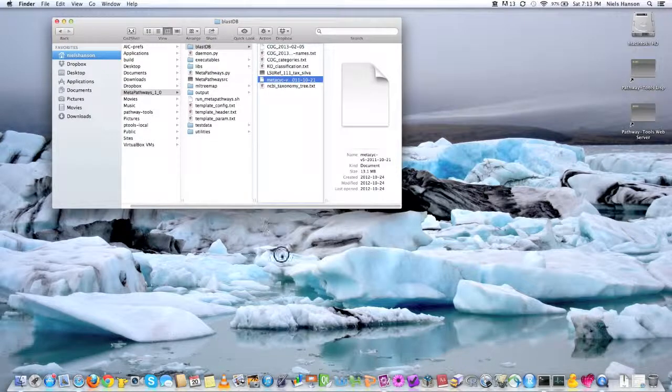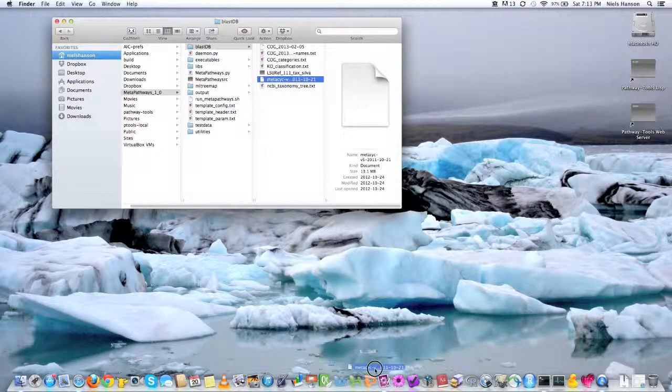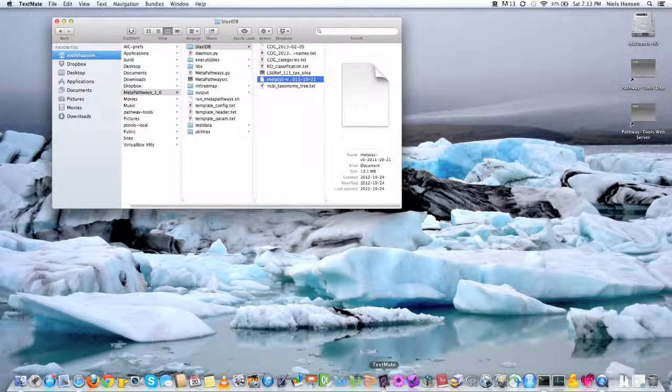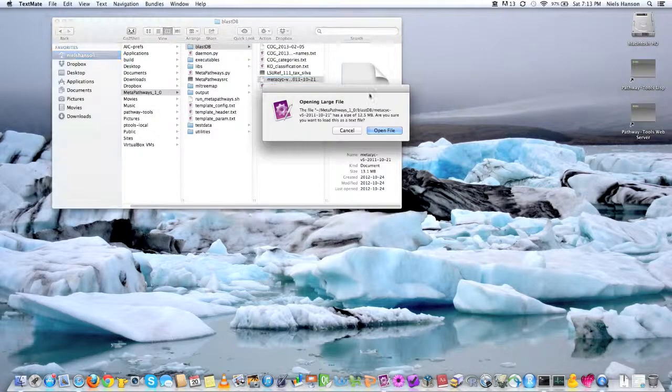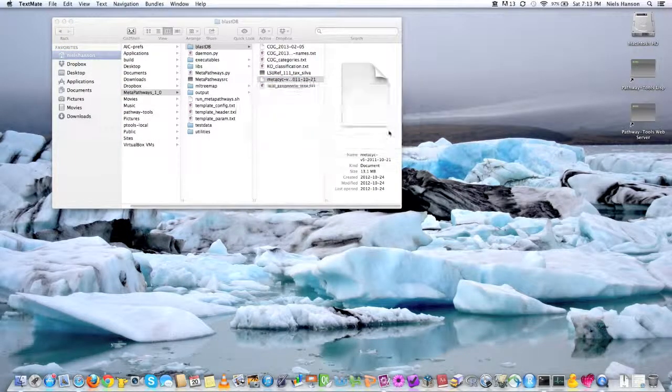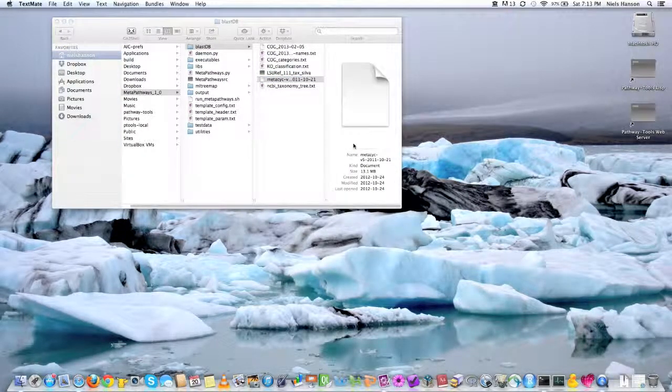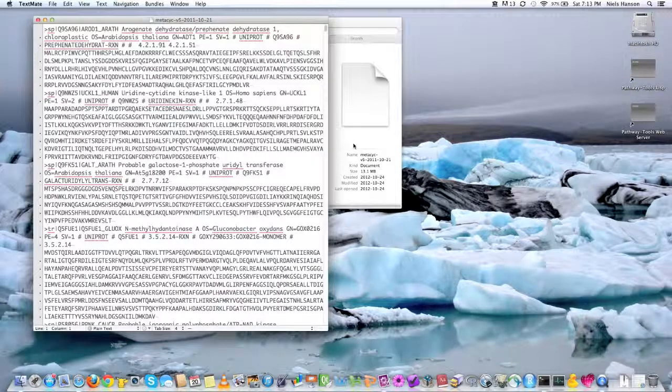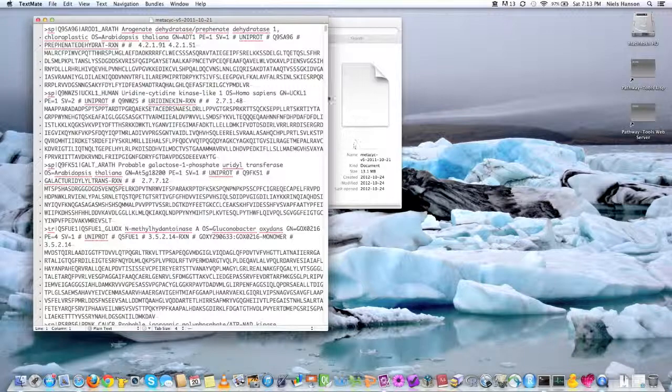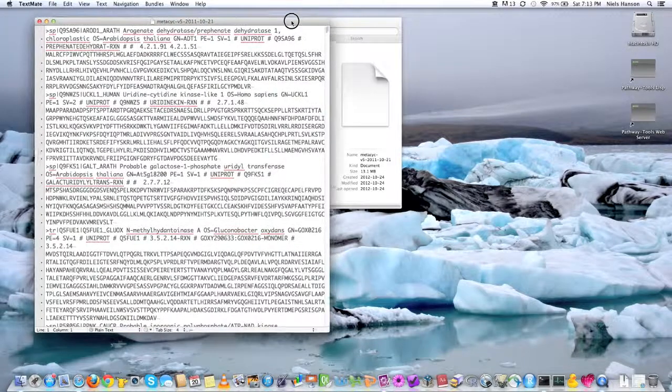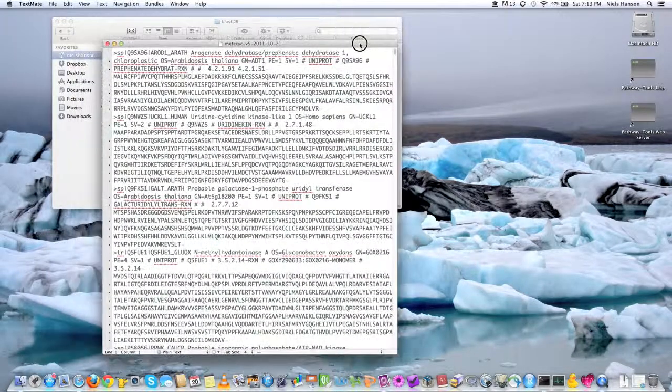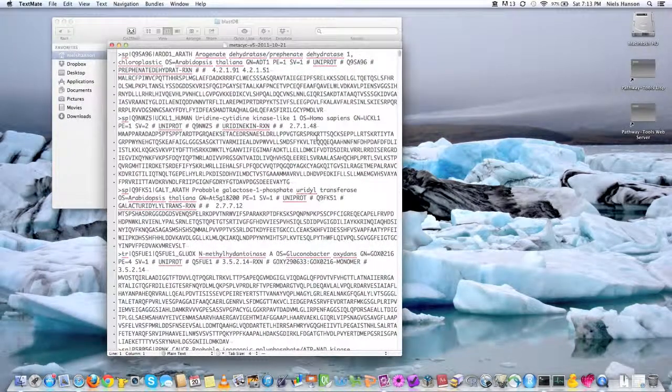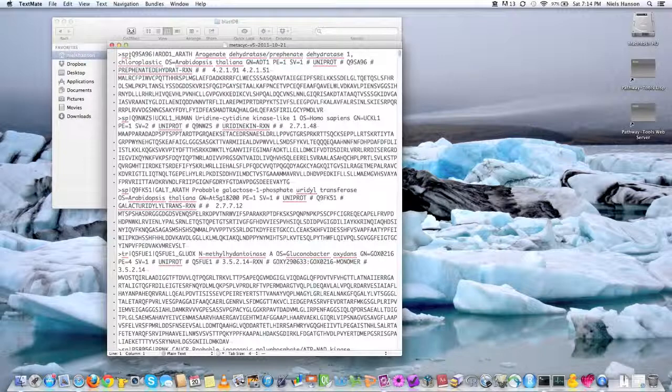So if I take this to a text editor and open it up, I can do this because it's not exactly a big file. You can't do this with a large database like RefSeq or KEGG. But as you can see, it's just a FASTA file.